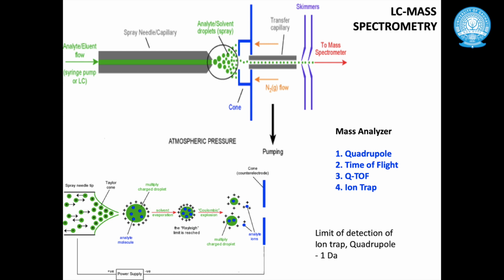Here there are 2 peaks. The scan has been done between 225 and 575 m/z. Here m/z means mass by charge, where m represents mass and z represents charge. Charge is sometimes plus 1 or plus 2, and different charges are there. In the case of GC, this charge is always plus 1, but in the case of LCMS, the charge may vary.